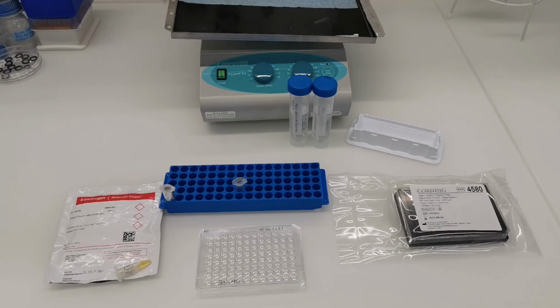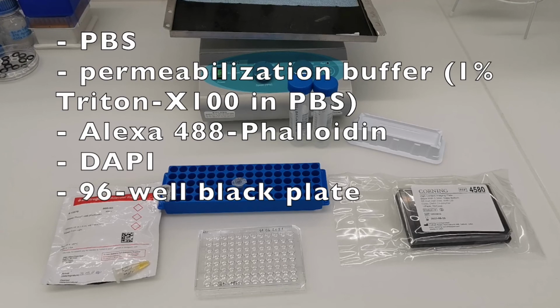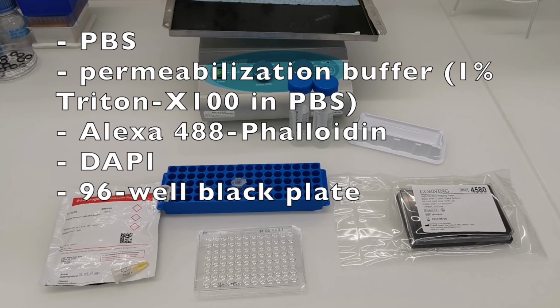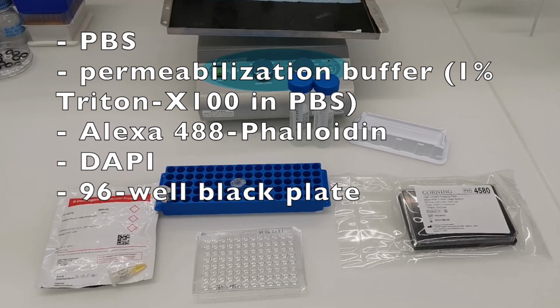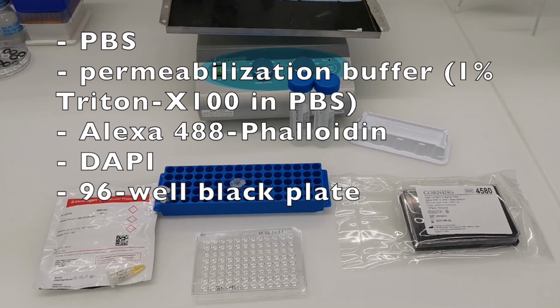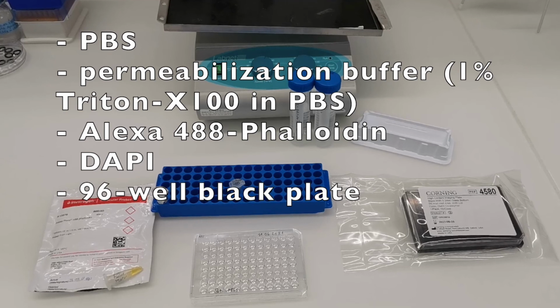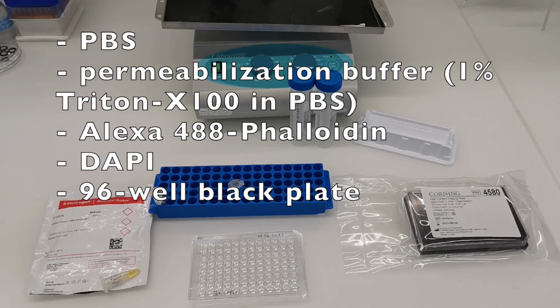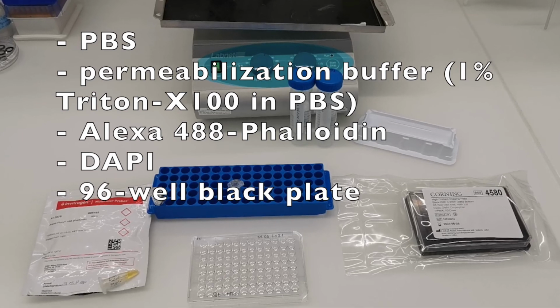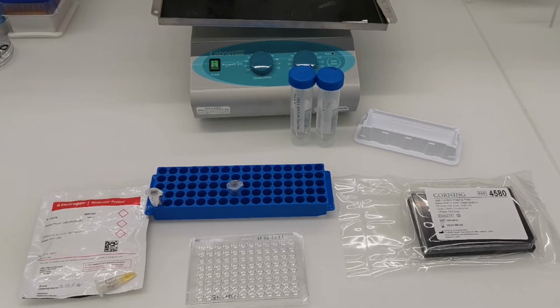Now we will show you a staining procedure using phalloidin. For this procedure, we need a 1x PBS. We need a permeabilization buffer, which is made using 1% Triton X100 in PBS. We will use Alexa 488 phalloidin as a phalloidin conjugate used to stain actin filaments in fluorescence microscopy, and DAPI as a nuclear marker. We are using black imaging 96 well plates with a clear glass bottom.